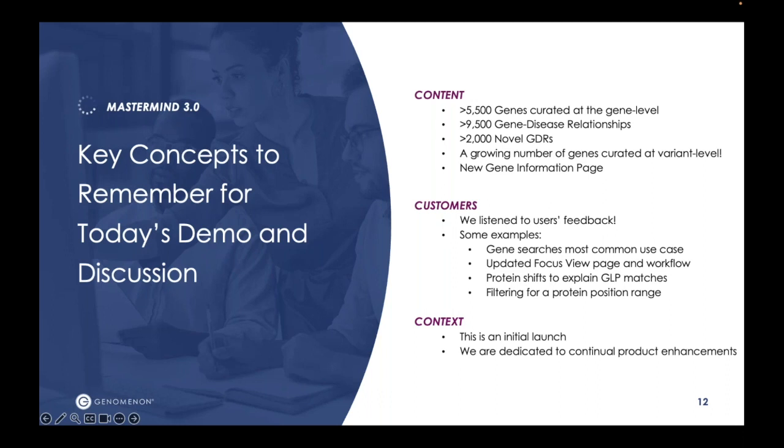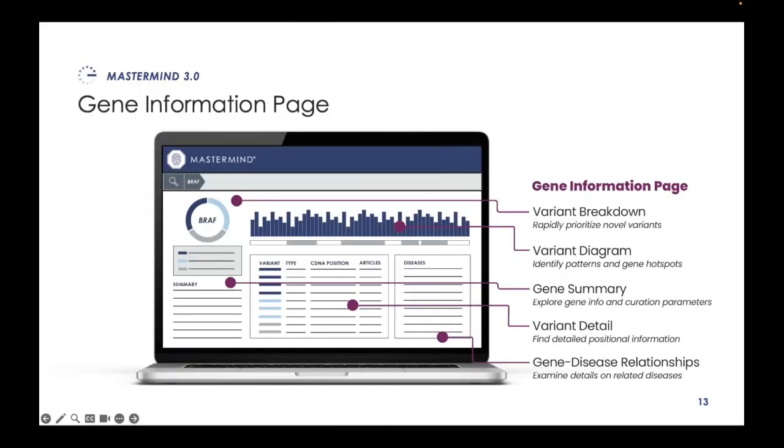And finally is the context that this is an initial launch. While we are very proud of the result here, and it has already met with a very positive response, we are dedicated to continual product improvement. Next slide, please. As Denice and Betty give their presentations, please look out for places in the interface where this new and useful information is stored.